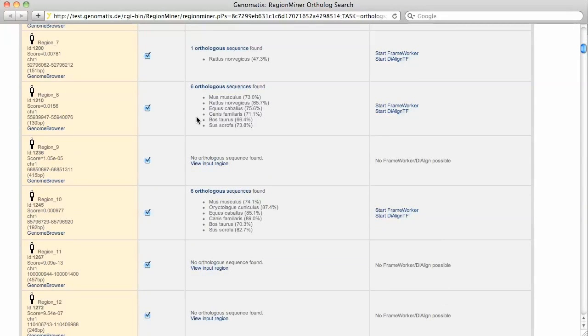And here we find a region with six orthologues in mouse, rat, horse, dog, cow and pig. Let's have a look at it in the genome browser.